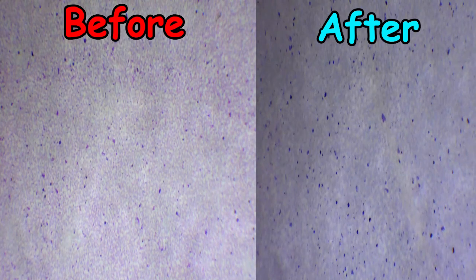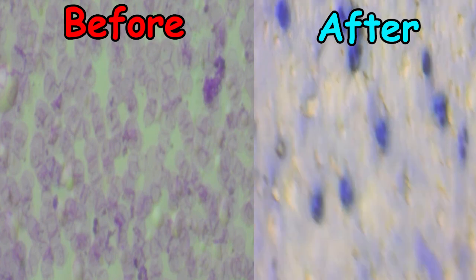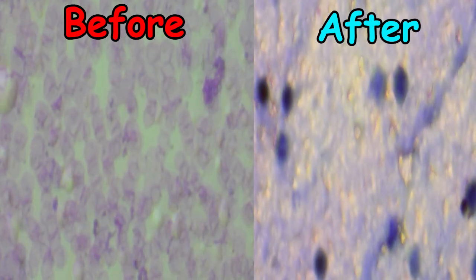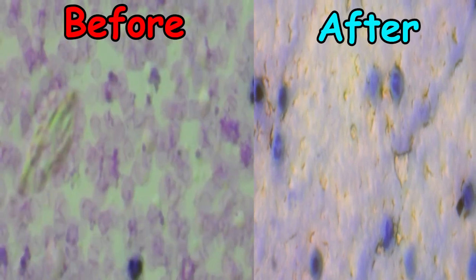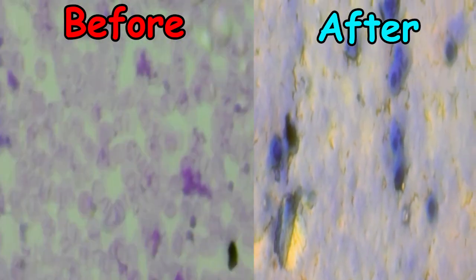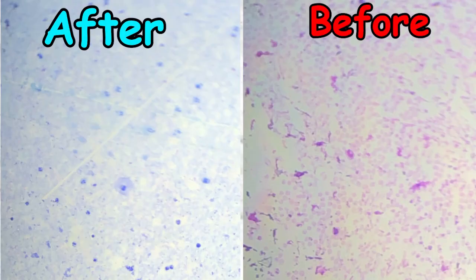However, at higher magnifications, there were a lot more visible white blood cells after my shot, when I was feeling the aches and had the fever. So yeah, the slide with my blood after the second shot had a lot more white blood cells, including lymphocytes. Just in case you didn't believe me, I bought a microscope to phone adapter to get some higher quality video. Here, look at these 2 photos taken on the same magnification.